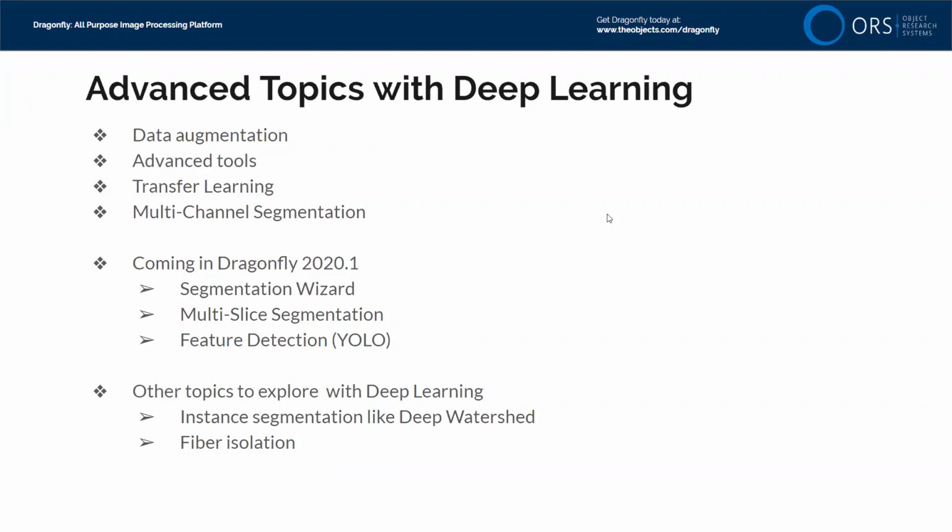Next question is, if you do transfer learning and train a pre-trained model on a new data set, does it update the original model or does it save as a new model? It updates the model. There is a duplicate button, as Benjamin refers to. You can duplicate the model if you want to leave the original one unchanged.